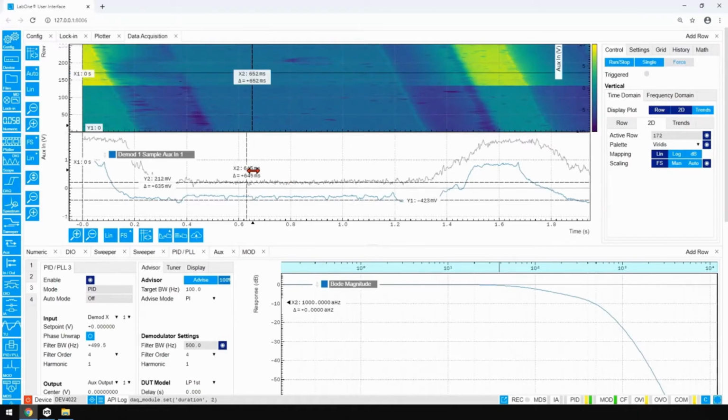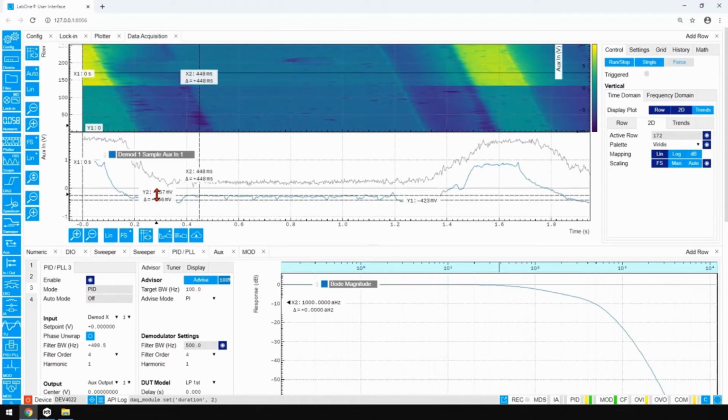Now we see that there's also a slight offset between AM and FM. That's the most obvious one actually. And so this is more like how the force is built up. So now to conclude, let's go back to the presentation.